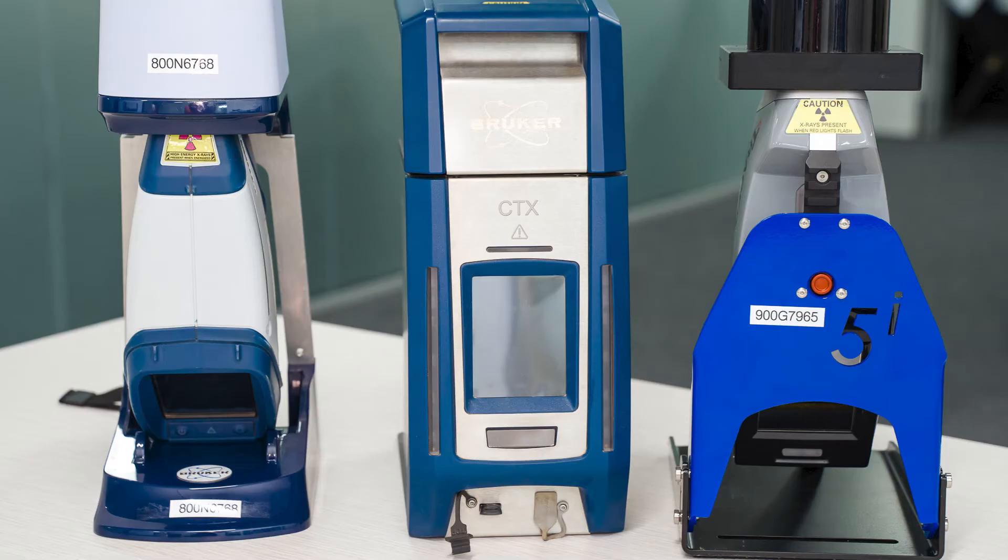So here at Portable Spectral Services we have a variety of portable x-ray instruments that we can hire out. We also sell Bruker portable x-ray instruments and we offer a variety of services including custom calibrations, servicing and training.